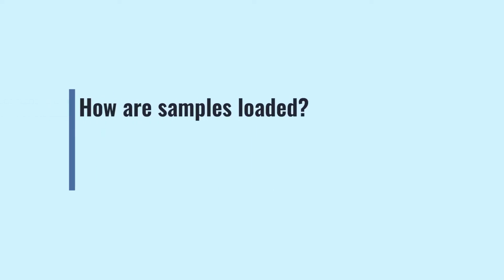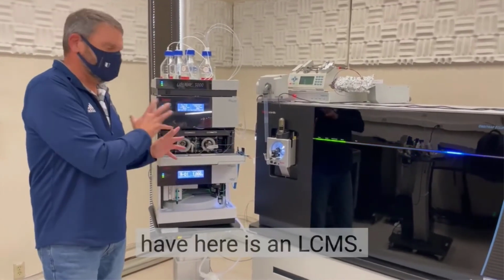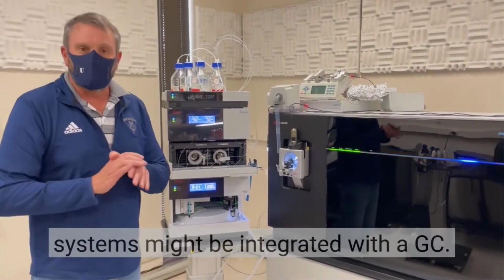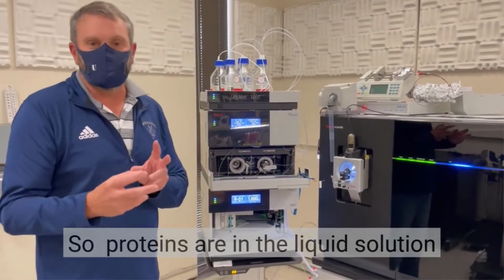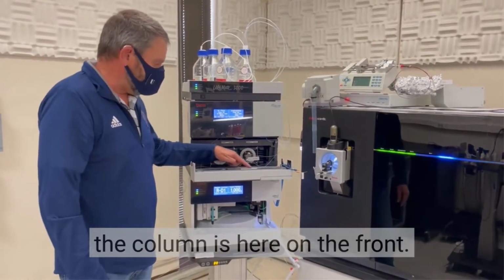How are samples loaded? This system that we have here is an LCMS, and you might see other systems integrated with a GC. LC is liquid chromatography. Proteins are in a liquid solution that goes through a column, and the column is here on the front.